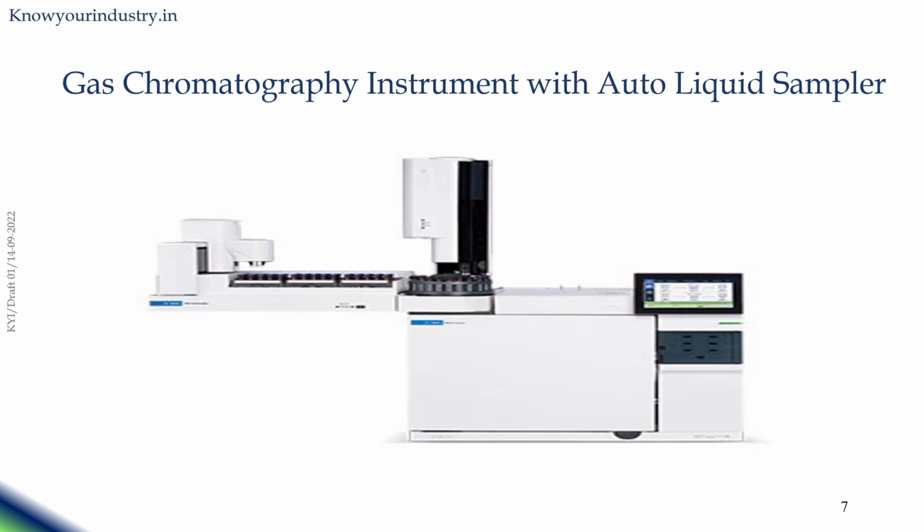This slide shows an image of a typical gas chromatographic instrument, which contains an auto sampler unit above the instrument, and all other parts are packed inside the instrument. You can see a monitor here. You can control the various parameters of the instrument, including the column temperature, auto sampler temperature, and the flow of the gas.